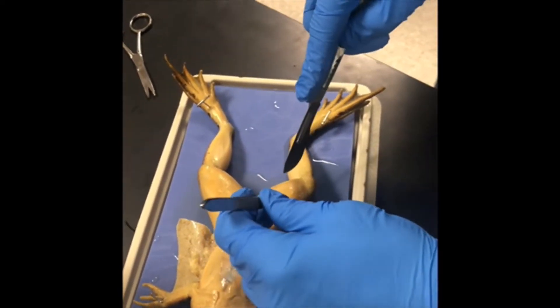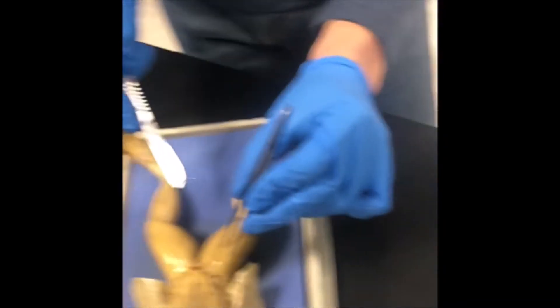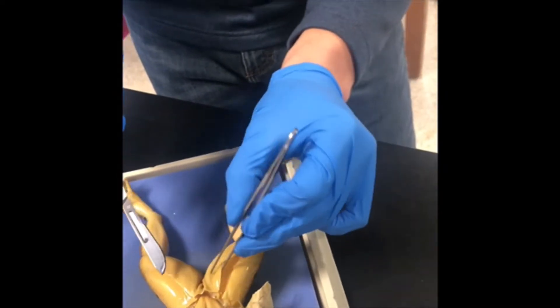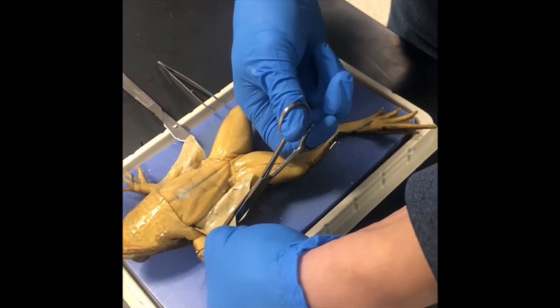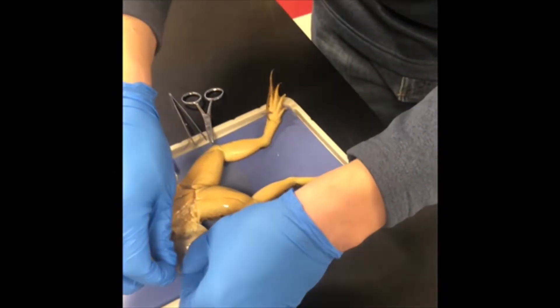I'm using the scalpel instead of the scissors, but I'm being sure to pull up on the skin with the tweezers. You're going to cut a small piece of the skin and put it on your placemat. Then pin the skin flaps out of your way.